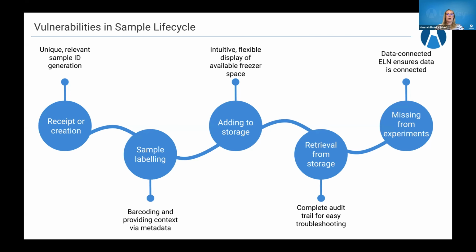When you add it to storage, I think both Dylan and Sydney made some good points around having to create workarounds in their lab, even with such a flexible system like ours, that can allow for the sample to potentially get lost along the way. So ensuring that you've got a good audit trail, even with those workarounds, is going to be really important.